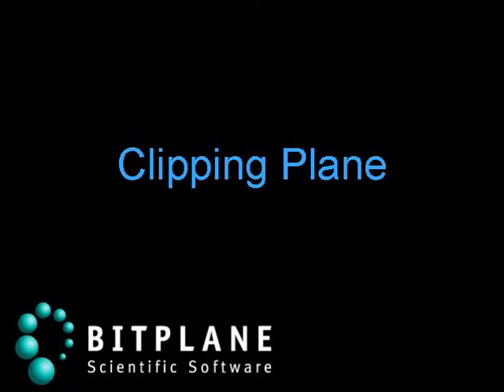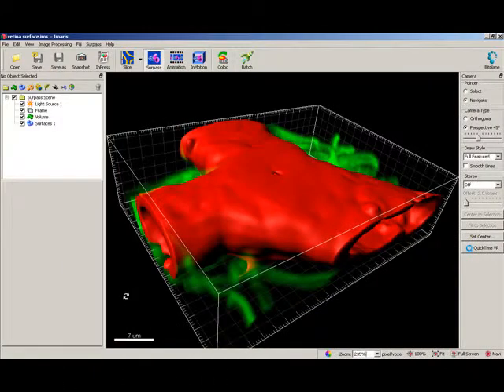Examining the exterior shape of a rendered 3D image may not always provide the best visualization of your data. To achieve a more desired view, it may be necessary to uncover hidden regions. In Imaris, you can better examine the internal structures of your 3D data by using the clipping plane.